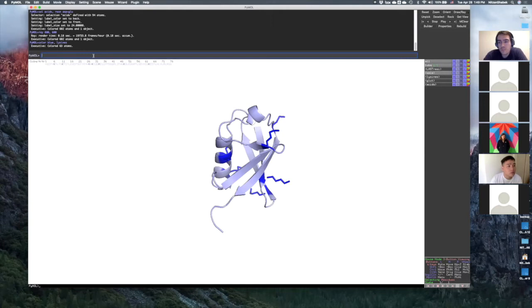And I'm just going to select that. So I'm going to press cell. So that's going to create this selection, I36. But I can call it whatever I want. I just want to say I36 because this is how I select that. And I'm going to press comma, space. And I'm just going to pick up one amino acid.